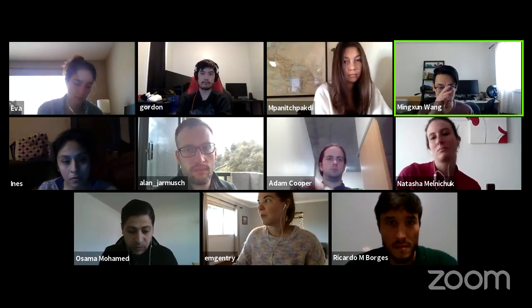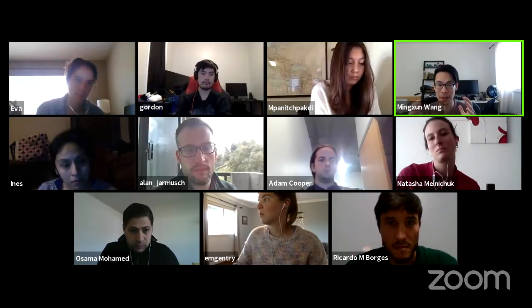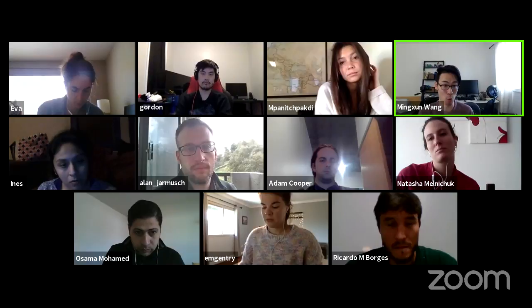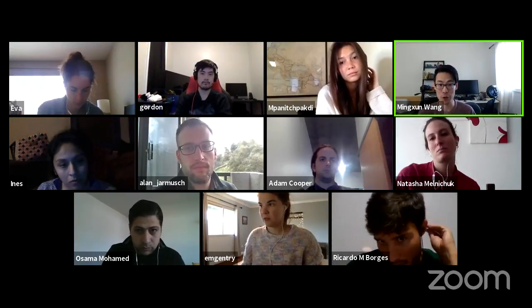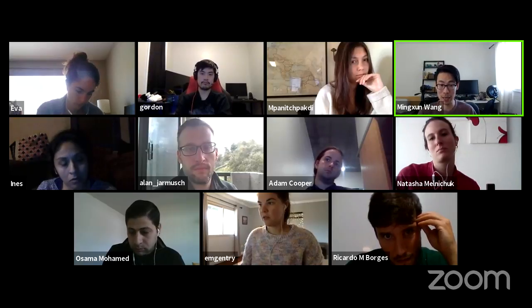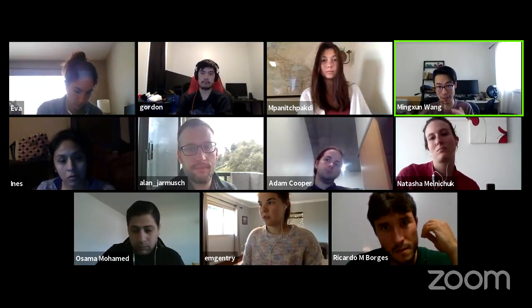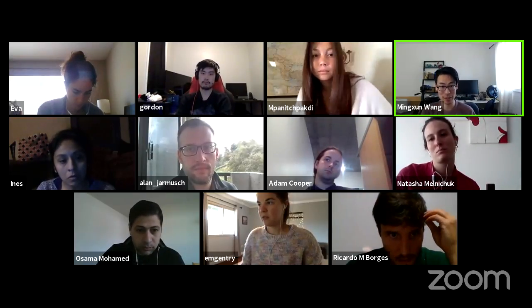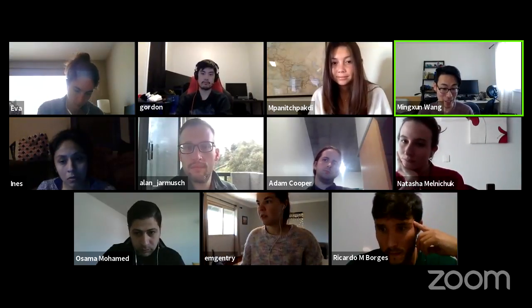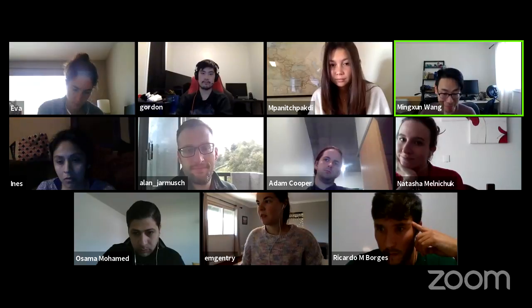Additionally, if you like to write code, it's an easy way to interact with it programmatically as a web API. So you can generate all the images for your entire data set in one for loop without having to think about how to get the data, it just does it for you. So anyway, I know Alan likes to do that.